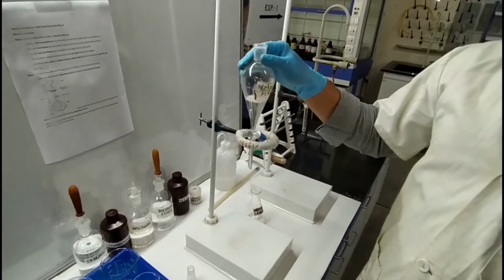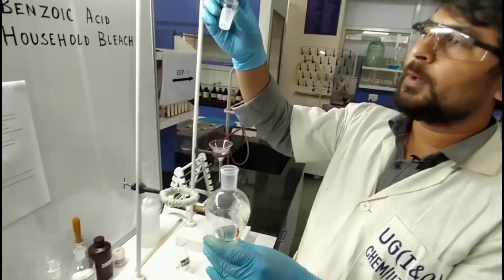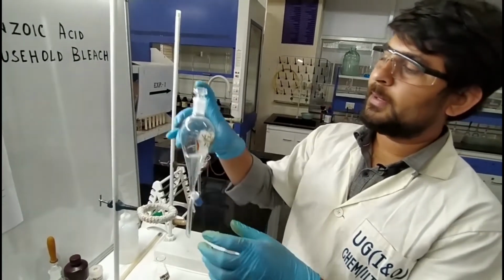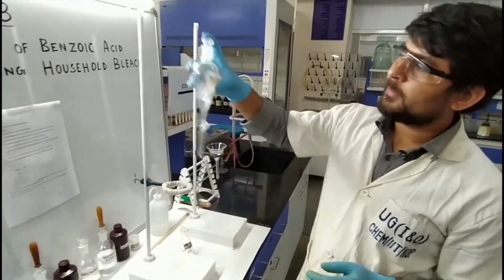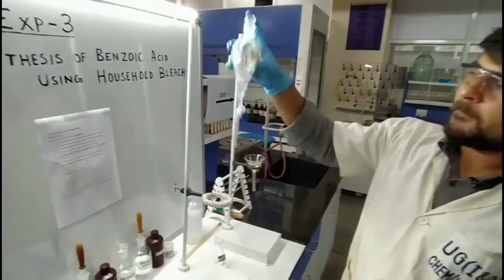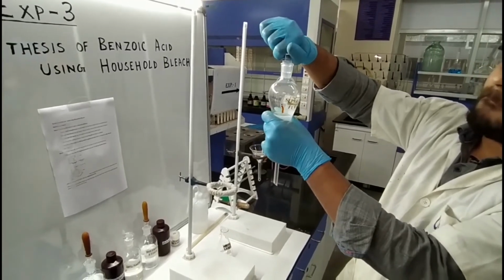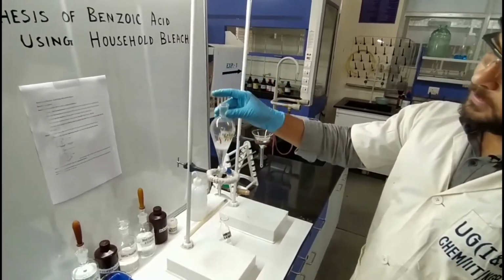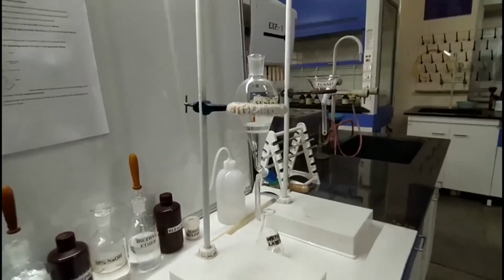Now we have to remove this from the ring, and put the cap on top, tight, and in this way we have to shake the two layers properly. Now we have to remove the cap slowly and keep this inside the ring again for a while, so that the two layers separate properly.